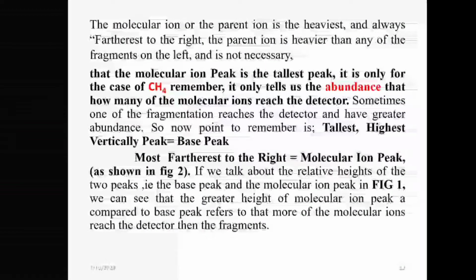Here in figure number 2, you can see the molecular ion peak is less tall as compared to the base peak, right? So that is the base peak. It is one of the fragmentation peaks, but it is the tallest peak, and it is next to the molecular ion peak.